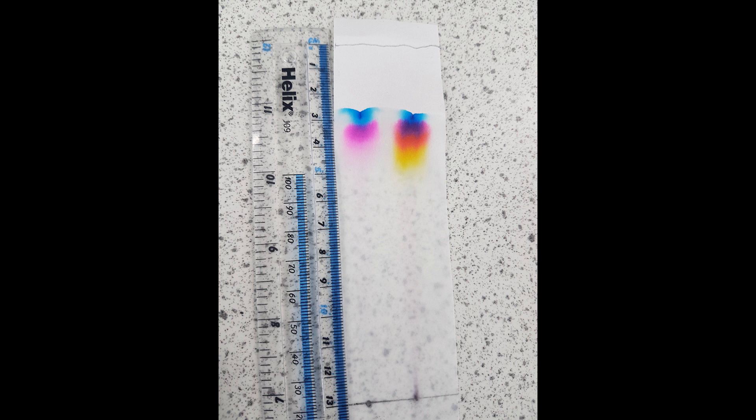Now let's say I want to work out the RF of the pinkish color on the left hand side. So I've got that nice beautiful blue and I've got that nice pinky purpley color. So I'm going to take the midpoint of that purple color and I'm going to see what distance it moved from the bottom line. So looking from the bottom line to the midpoint, I can see that it's moved approximately nine centimeters. So from 13 to three and a half centimeters, the difference is nine and a half centimeters. So what I'm going to do, I'm going to take that nine and a half centimeters and divide it by the total distance of the solvent, which in this case is 13. So it'll be nine and a half centimeters divided by 13 centimeters. That will give me my RF for the pink point.